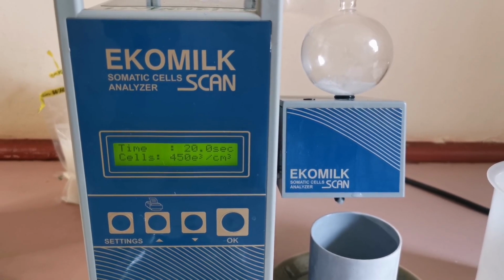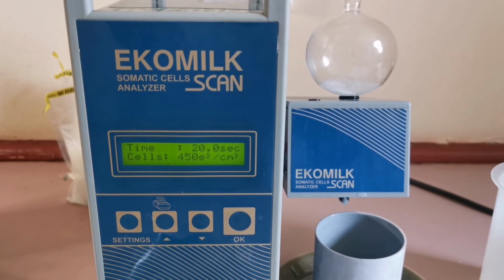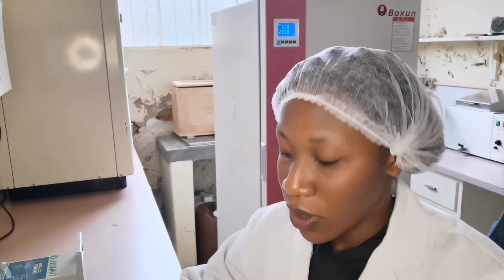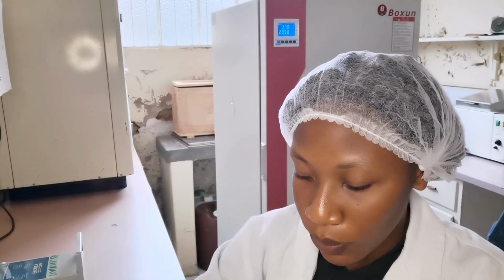450 is the somatic cell count for this milk sample. So now the agar has finally set, so I'm now putting these petri dishes into the incubator.